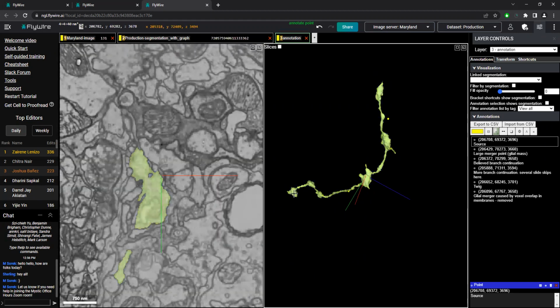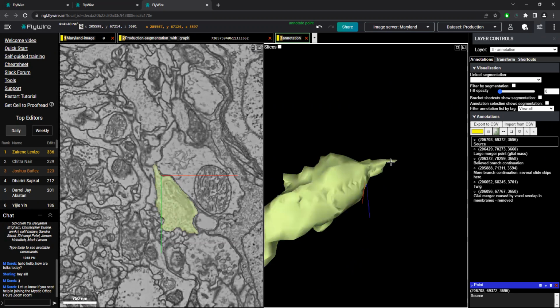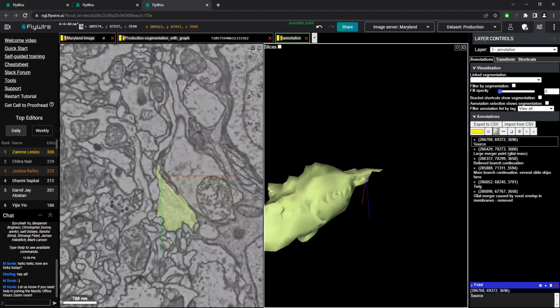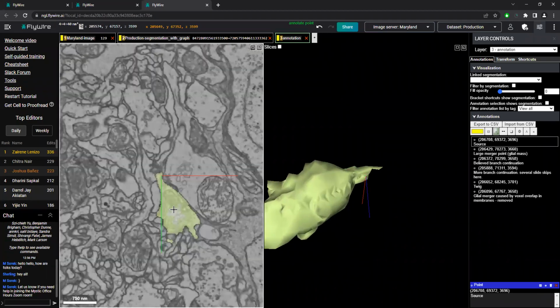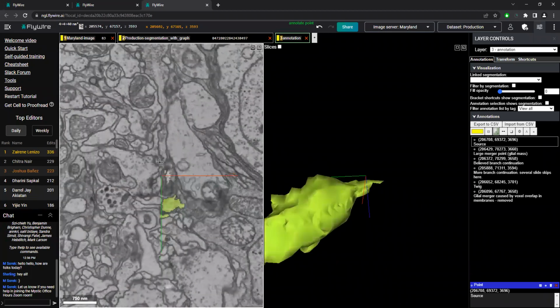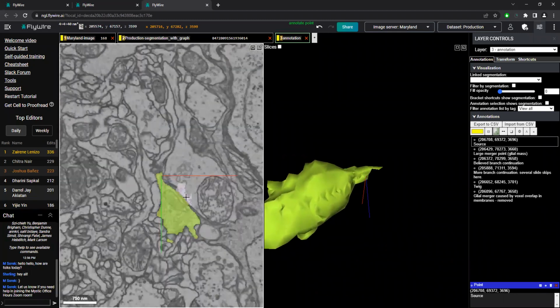Azure already gone through and checked a lot of the spots here. Here we can see there's a distinct cutoff because it's a little flat here, and none of the other spots seem to have any areas of continuation. If we look here too, we see there's a black slide in between where we're missing one, and that's maybe why the computer couldn't see where to go. The problem is it's not very distinct where we're supposed to go. Which one is it, and where do we go from here?